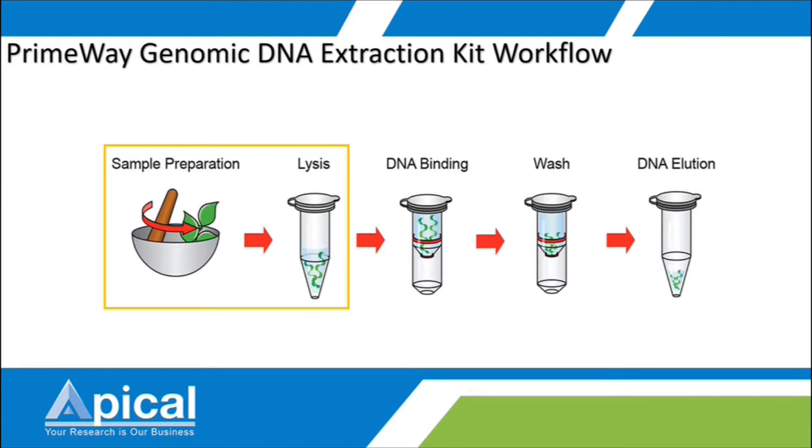So bacterial cell and animal cell have some differences. Even gram-positive and gram-negative bacteria also have differences, right? Plant cells have even more differences and are much more difficult to lyse. So we need some specific methods to break the membrane of the cell.